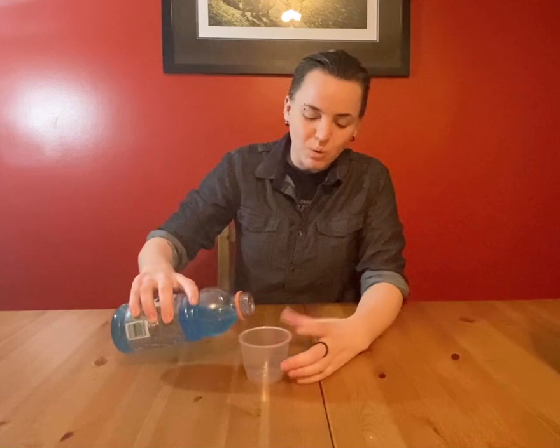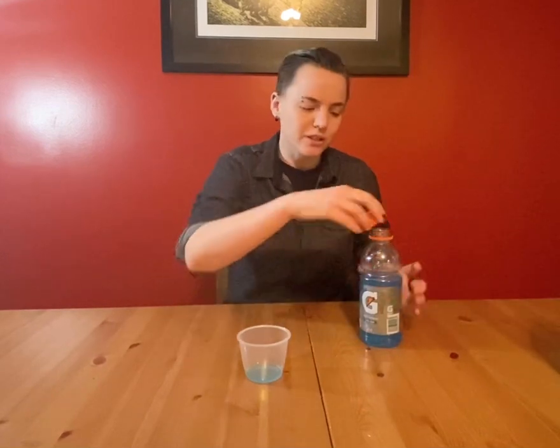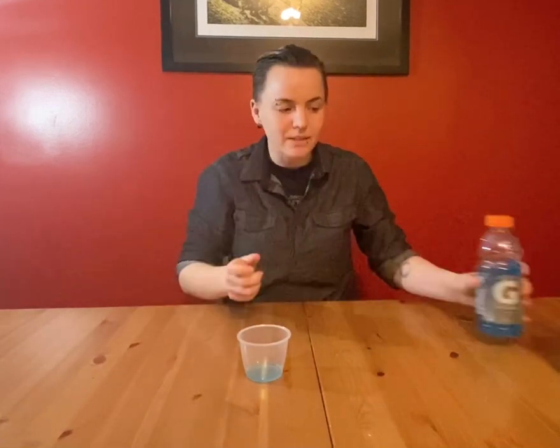So in this case, product placement: Gatorade. And the reason we use a sports drink is actually related to the whole osmosis thing. So you need an isotonic solution. And what isotonic means is that this solution is at the same concentration as our cells.